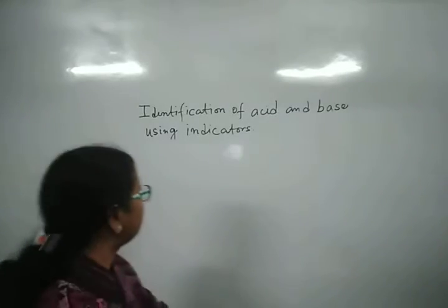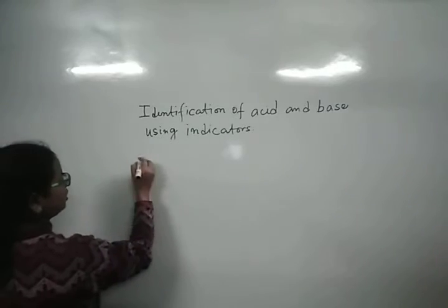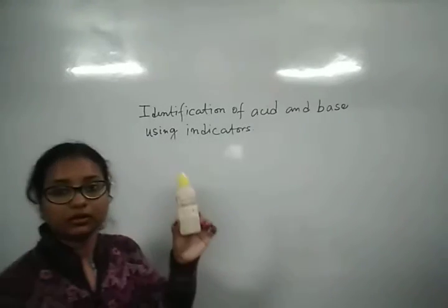First of all, the indicator which we are going to use today is phenolphthalein.